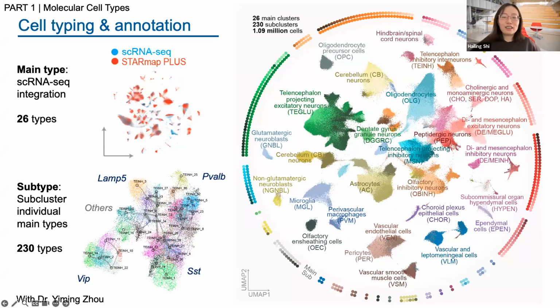Right, this is a very nice question. It is indeed very challenging to cluster and annotate a million cells. It's a back and forth process. We finalized a 2-step annotation because we want to utilize the established nomenclature for neuronal cell types, so we have a mid-type level label transfer.